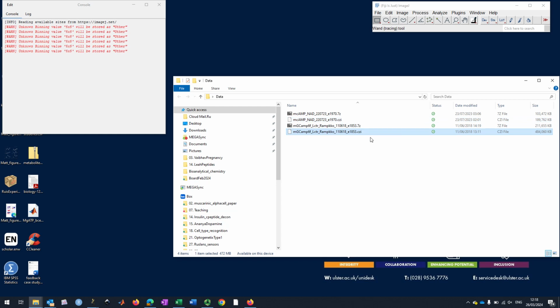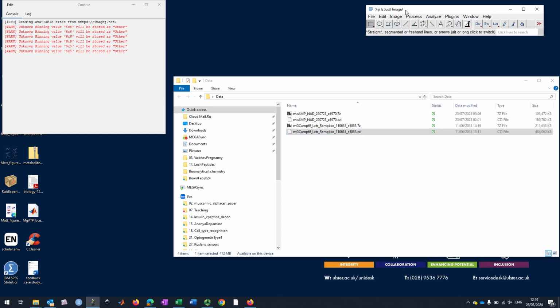The tool that we shall use to analyze this data is called Fiji. Fiji is just ImageJ, is a typical slogan of the software. The true reason for that is that the original program that is to be used is called ImageJ. The first version was written 20 years ago by Wayne Rasband at NIH in the United States. Fiji is like a repack of ImageJ, ImageJ plus various plugins that allow you to analyze things better.